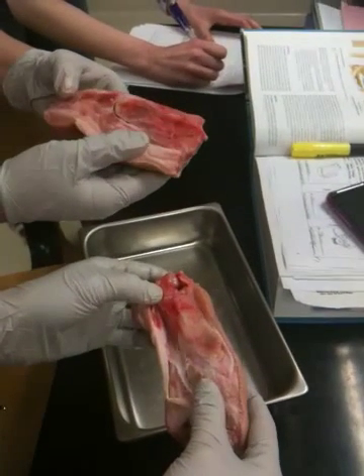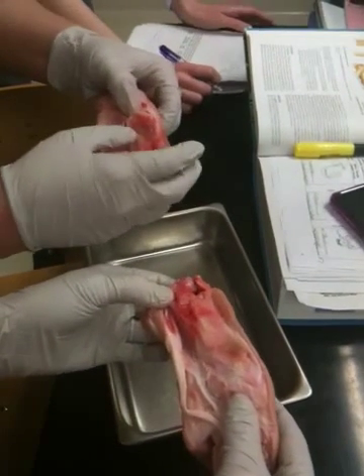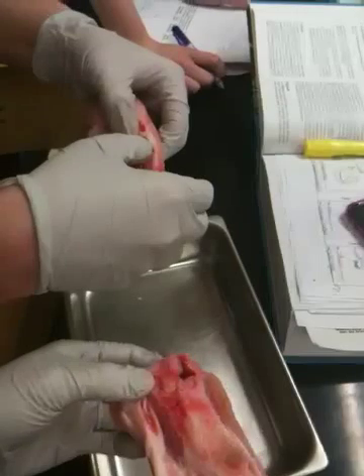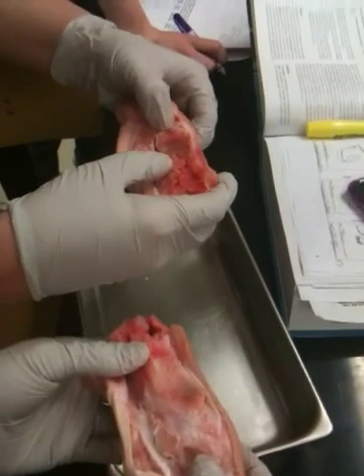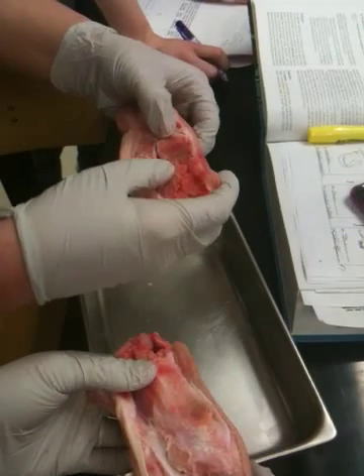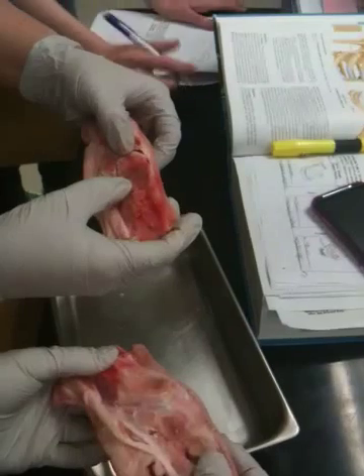The epiphyseal line — now on these ones, they're a little fresh, so it's a little hard to see. But see if I go back and forth, there's a line right here. See it in the light? That dark line? That's your epiphyseal line.